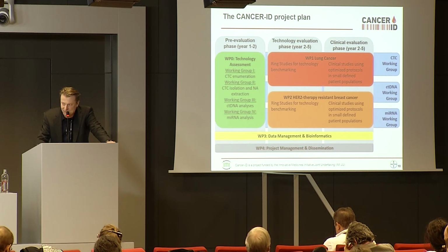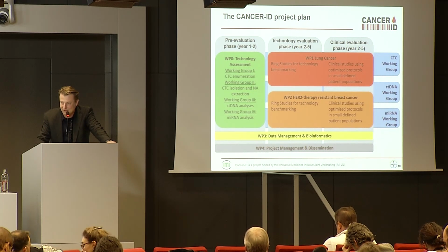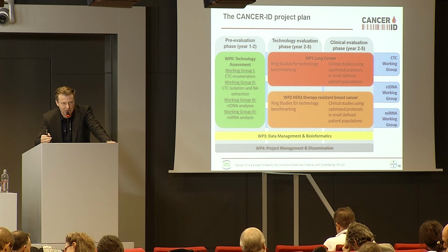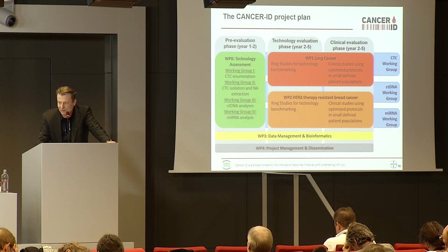We found, and that's why I have these little blue fields there, there is some overpromising when you look at the technologies that are sometimes advertised. And we found that it's very, very important that we keep up those working groups for the different biomarker classes and that we continue to further develop those protocols. It's not trivial. This starts from pre-analytical sample handling. This starts with storage times. This starts with different blood collection tubes, fixative, yes, no, shipment times, shipment temperature, mechanical stress introduced into the sample. So there's a lot of variables that can affect the quality of what you're finally getting. And this is certainly something we need to look into over the whole period of the program.